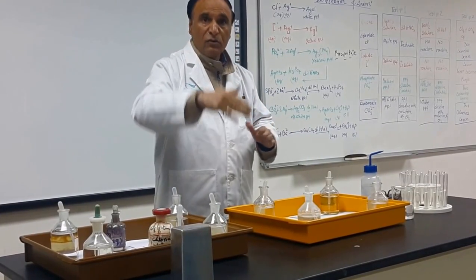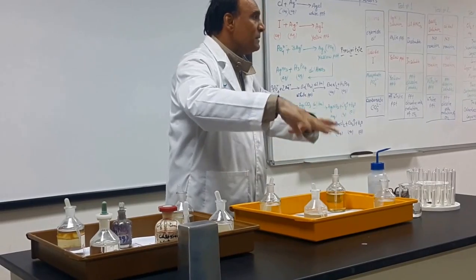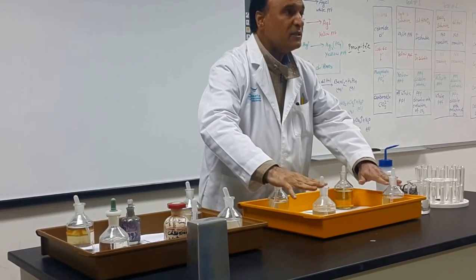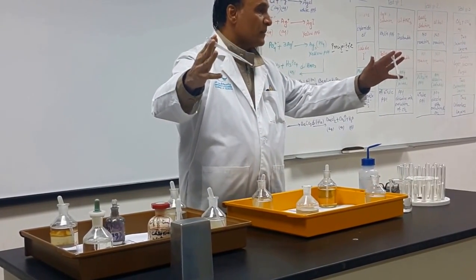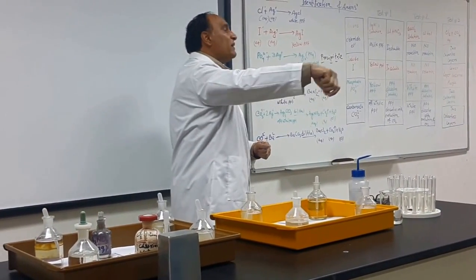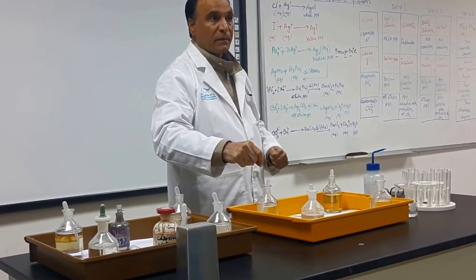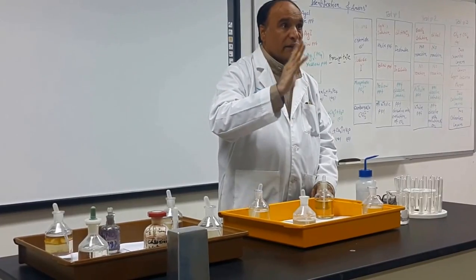Because when you are doing the experiment, all the bottles are busy. Some student is taking this one, some student is taking this one. And maybe it is empty, no dropper is there. So if there is no dropper, don't put the dropper back just anywhere you like. Make sure that you put the dropper in the same bottle. Did you understand? Yes. It's a very, very important point. Learn it, remember it.